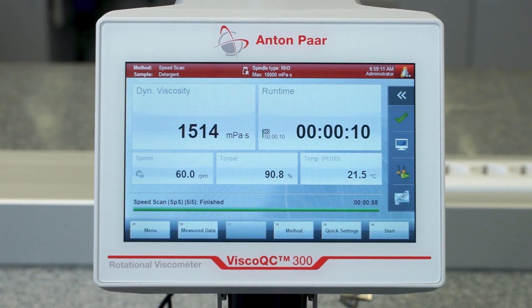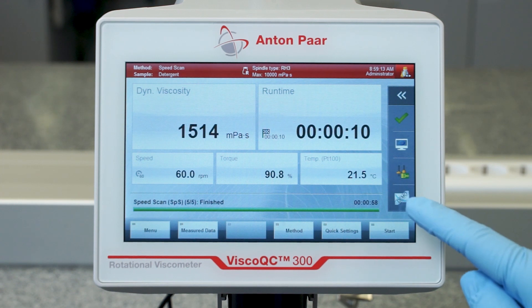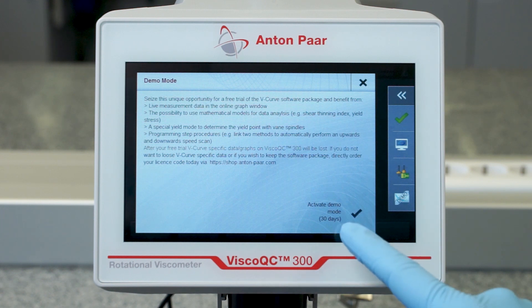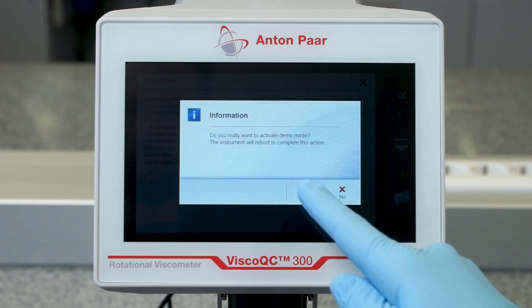Your standalone system is upgradeable at any time with compliance and/or additional analysis software. A free 30-day demo trial of the additional analysis software v-curve is included in every VSCO QC 300 delivery, and it can be activated at any time.